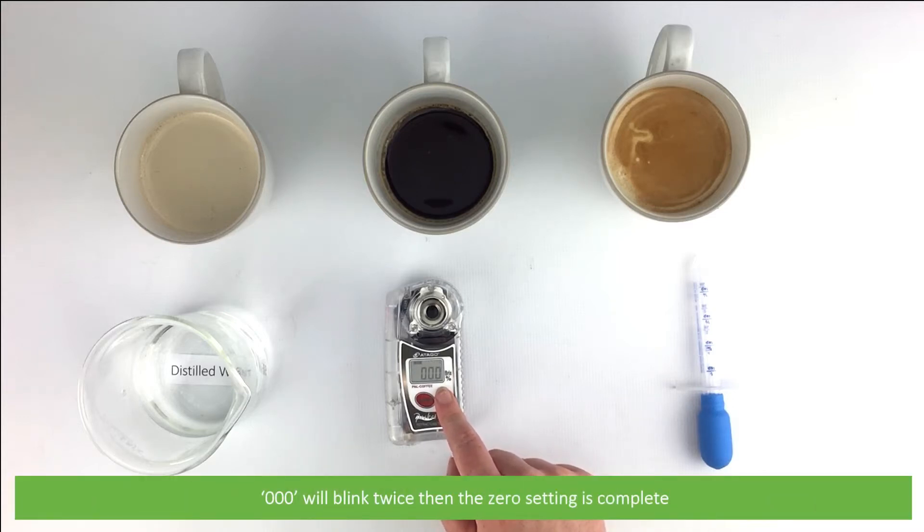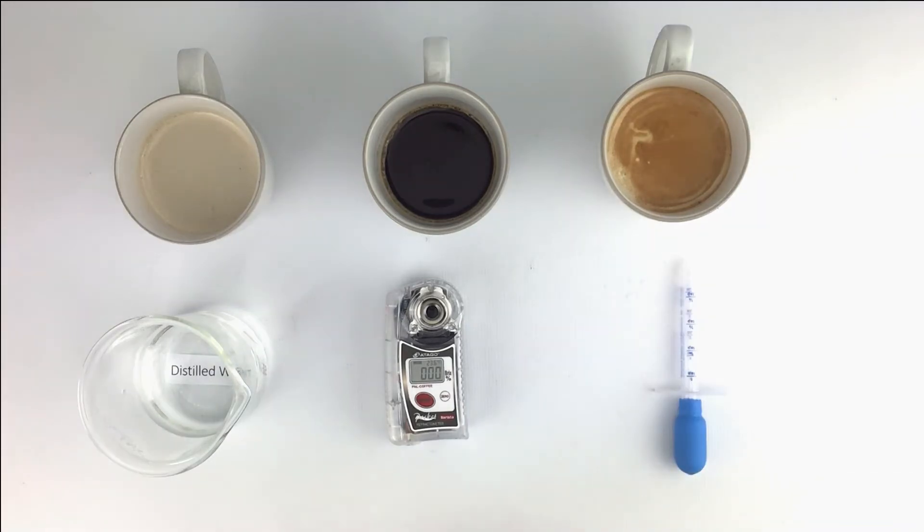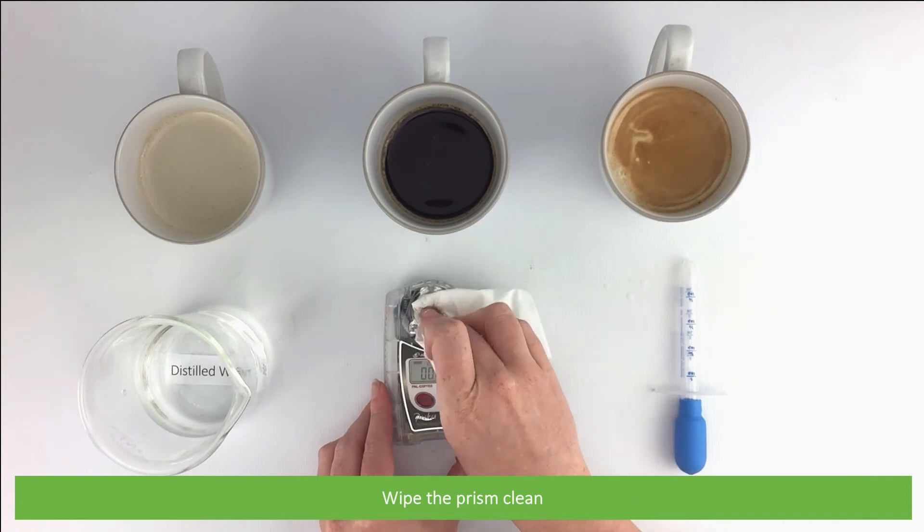Triple zero will blink twice, then the zero setting is complete. Wipe the prism clean.